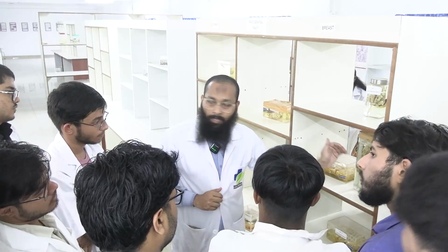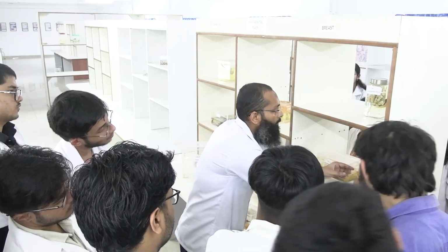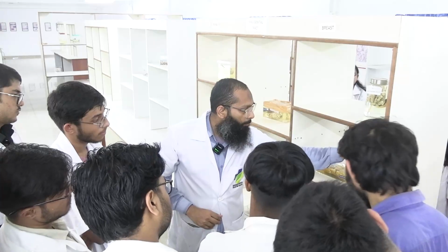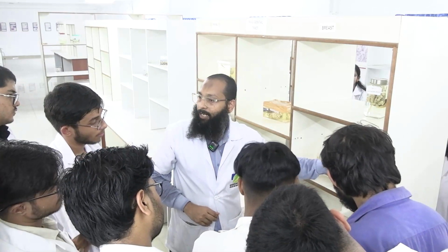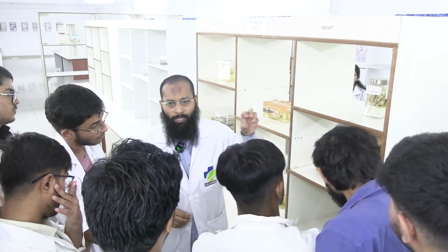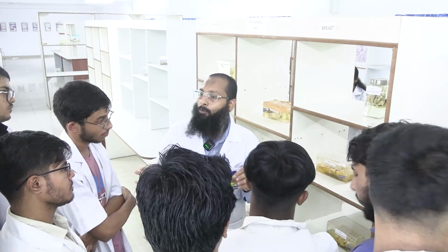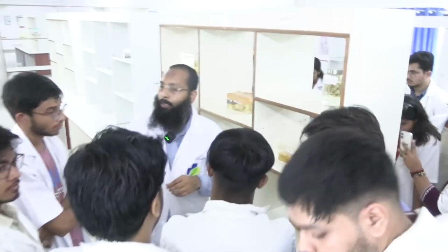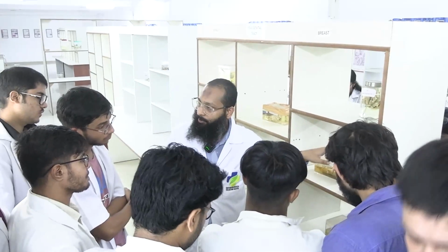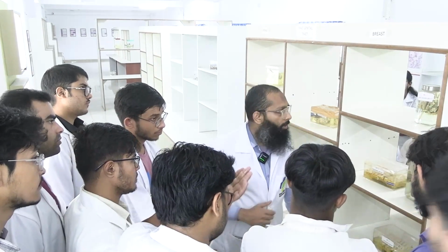Then we go for the tumor proper. We take 2 or 3 or 4 sections from the tumor proper. Then we give one section from the Nipple-Areola Complex. This Nipple-Areola Complex has got distorted because one section has been taken out. Then we give a few sections from the normal looking breast, to look for any DCIS component or any pre-malignant lesions, and then we go for the lymph nodes. What is the importance of lymph node?